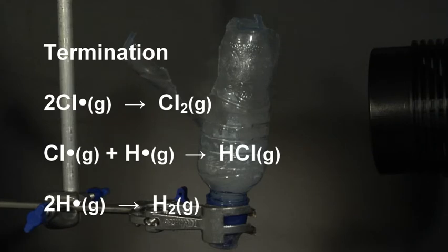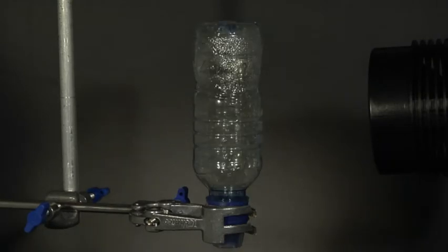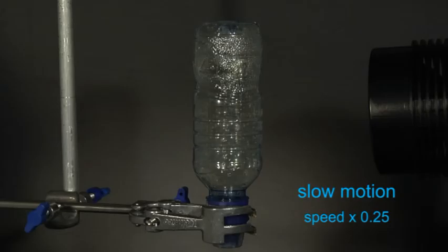Chlorine molecules form atoms or radicals when exposed to bright sunlight. In this demonstration, the flash gun provides sufficient energy to break the chlorine-chlorine bonds homolytically. BOOM!